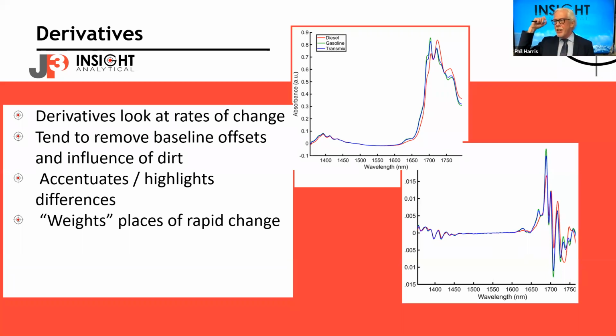We just did a test where we built a model and then took 12 samples over the space of about a month and sent them to the lab and compared. And we were within, if I remember the number, about 2.5 kPa.